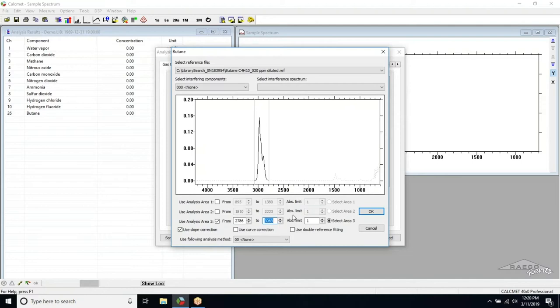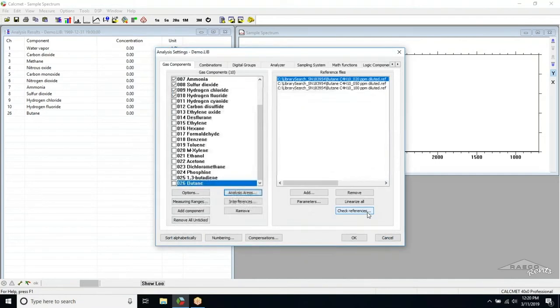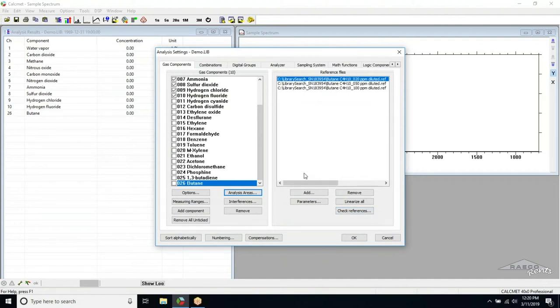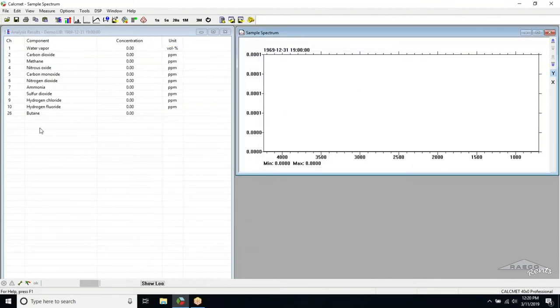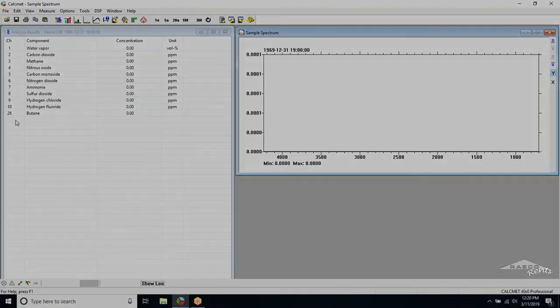When the area has been properly edited, we can click OK. We only need to perform this step once for each gas, as the analysis area will apply to every reference file for that gas. All we need to do now is make sure that the new gas is checked in the Gas Components window and click OK. Now you will see the new gas appear in the Analysis Results window, and you're ready to begin sampling.